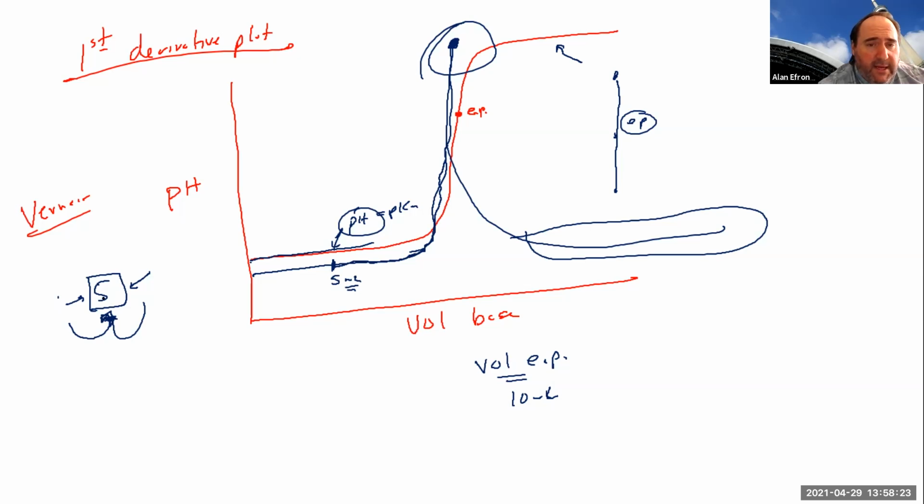All right, so the third part of the experiment is very similar to the second part. The only difference is you really will just be doing a titration of an unknown acid. And I believe, if I'm not mistaken, these unknown acids are going to be solids up on the computer program. So you'll have to weigh out some grams of it, I think.